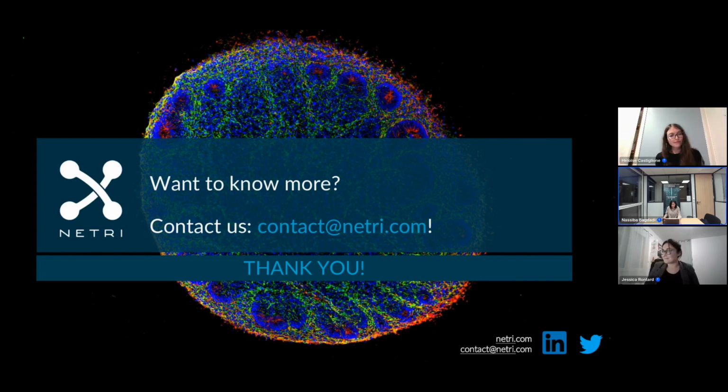Another question for Eloise. Have you tested other cell lines? Yes, we have tested 2 iPS lines. So most of the experiments that were presented are based on one iPS line from a healthy donor, but we have also tested another iPS line from a healthy donor, and up to 60 days of culture, we observed similar results in terms of sizes and cytoarchitectures with the two lines.